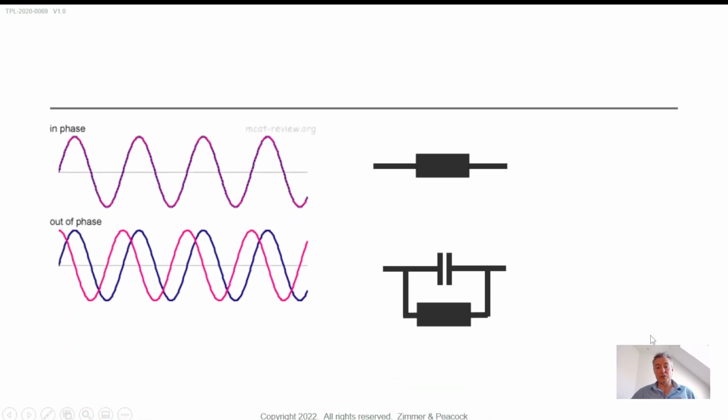There's something interesting in electrochemistry: a surface, when you have an electrode in a solution, is acting partly as a resistor and partly as a capacitor. If the surface is acting purely as a resistor, as you change the voltage, the current is exactly matching it. That's a pure resistor. There's no lag. I change voltage, current's changing, completely one for one. They're overlaid. If a surface has a capacitive element to it, the surface is trying to act slightly differently. The surfaces in electrochemistry, especially immunosensors, actually have a capacitive element to them.